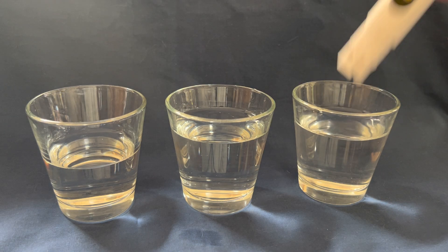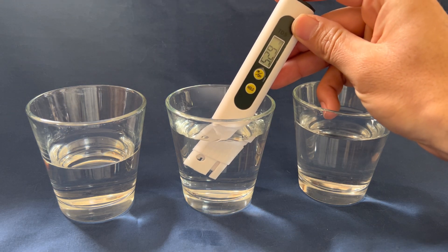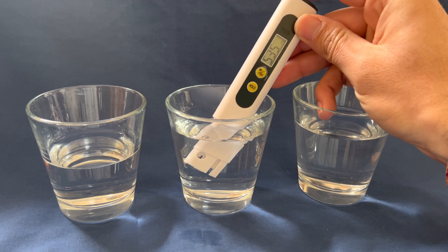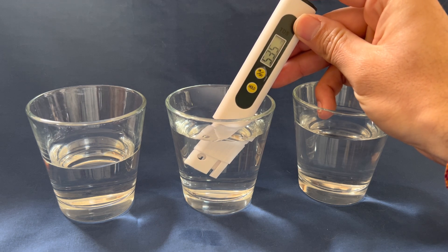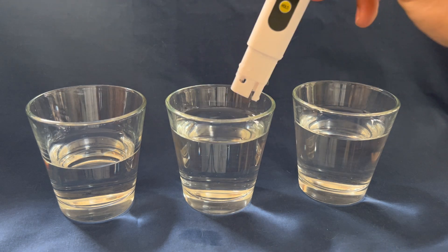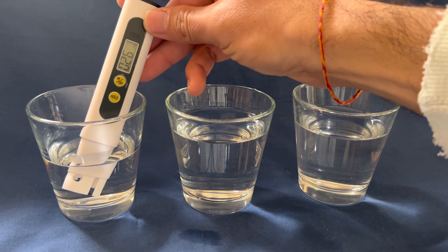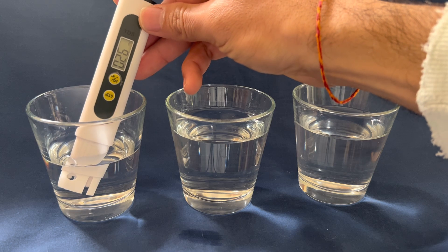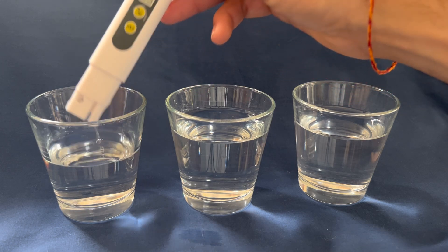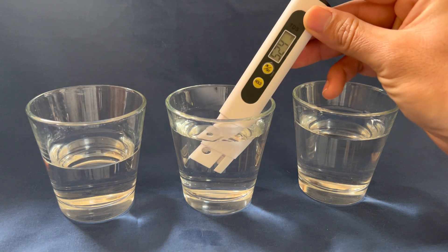So that's most likely tap water. This one is also 535, which means my water purification system is not working at all. And then this is bottled water — 26 parts per million, which is significantly less than the other two. So I do know I have a problem with my water purification system, and that's exactly why I bought it.